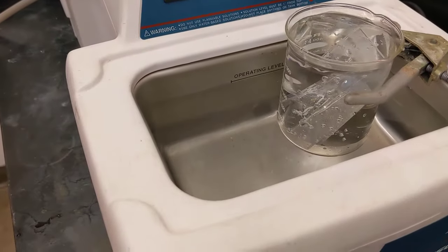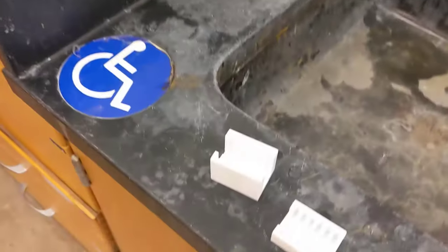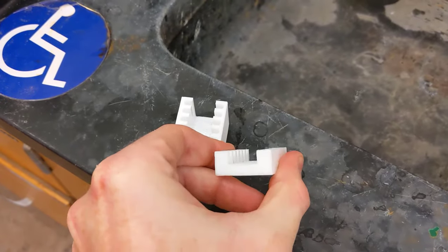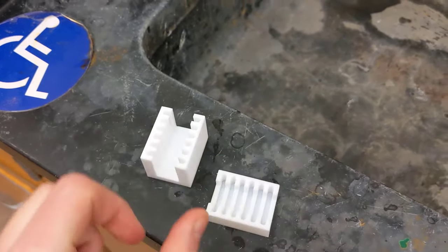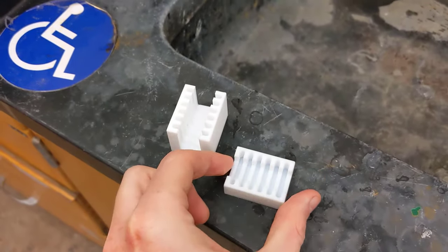There are several dividers available in the lab. Here are a couple examples of Teflon dividers for cleaning silicon or glass chips. They just drop into the bottom of the beaker and keep everything upright and far away from each other.